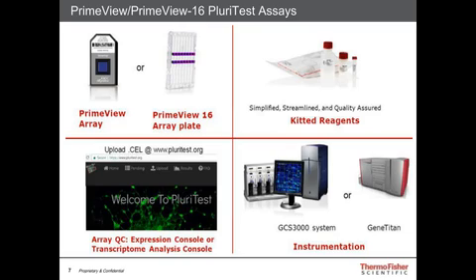Bottom right panel is the instrumentation required: a fluidics station for washing and staining the chips, and a scanner, GCS 3000 for PrimeView array, and GeneTitan for 16-array plates.